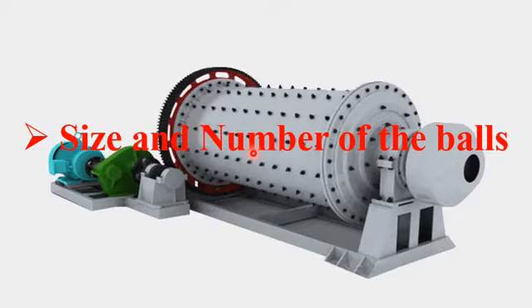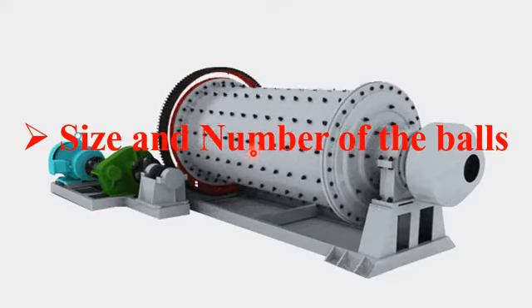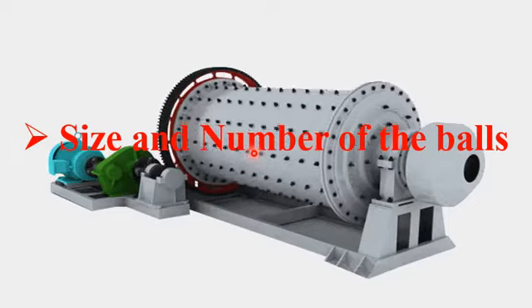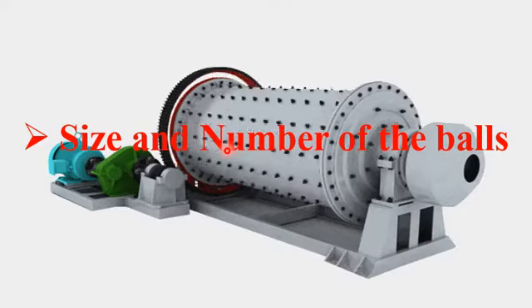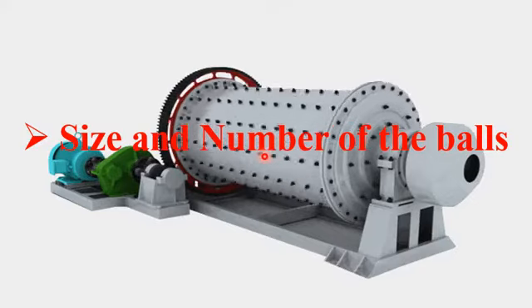Due to this overlapping there is a possibility of a decrease in the efficiency of the milling of the bulk material, number one, and number two, a possibility of incorporation of impurities.